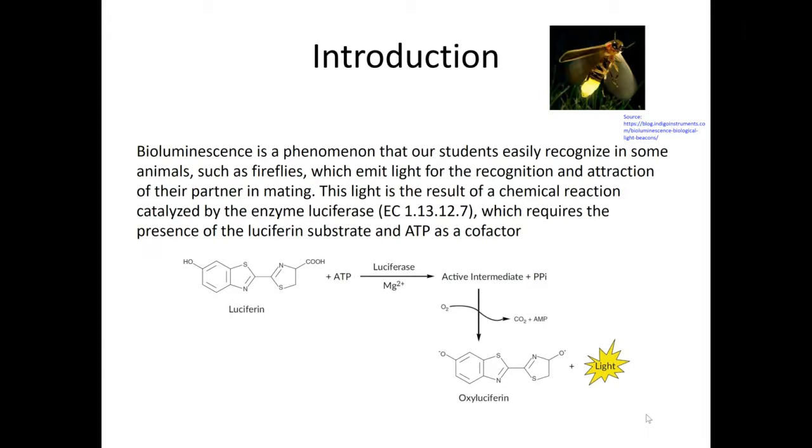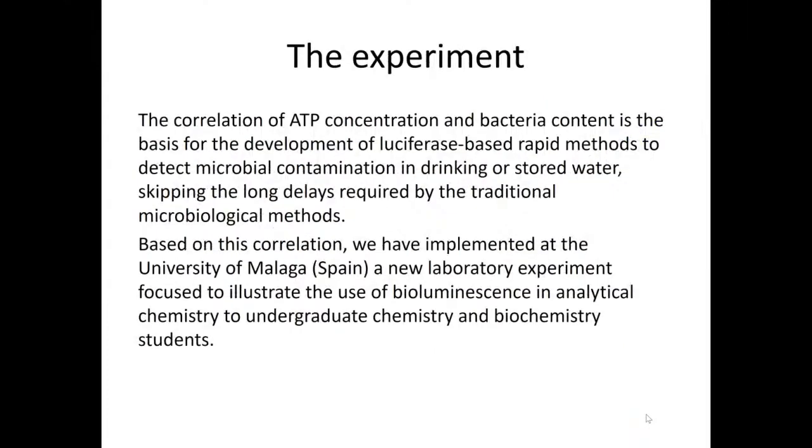What is very interesting in this reaction is that ATP is a cofactor, and that the light that is produced can be correlated to the ATP concentration. Given that ATP can be found in all living organisms, the concentration of ATP can be correlated with the presence of microorganisms in water, for example, in tap water.